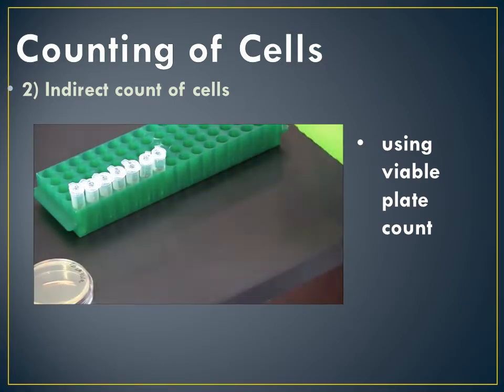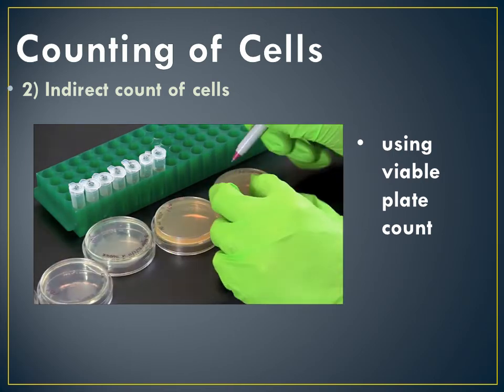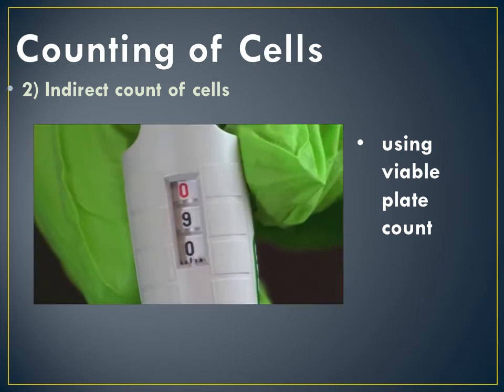In this method, serial dilutions of a sample containing viable microorganisms are plated onto a suitable growth medium.